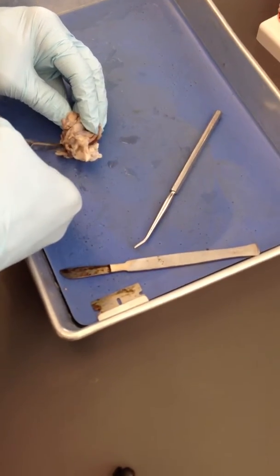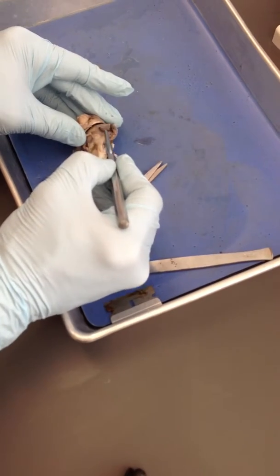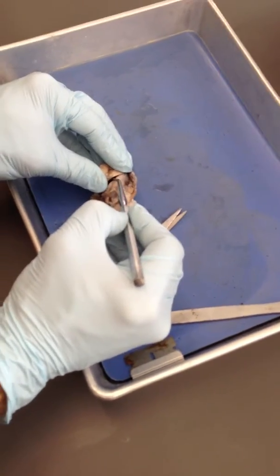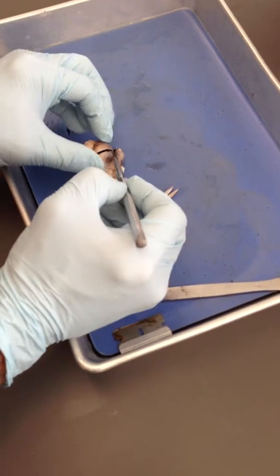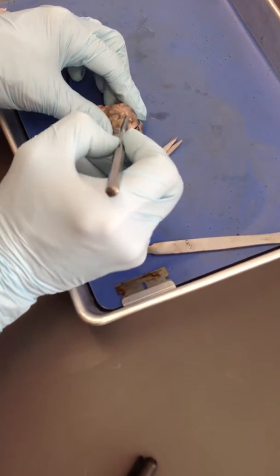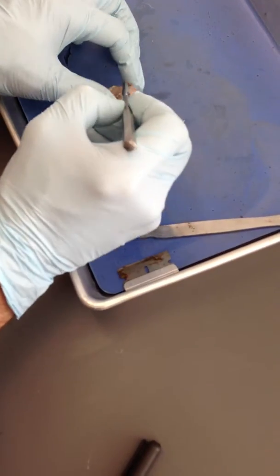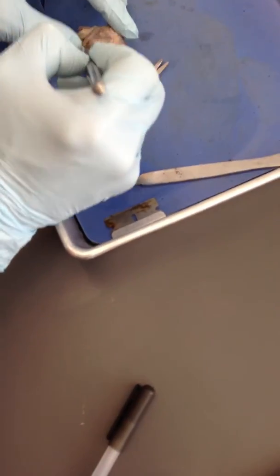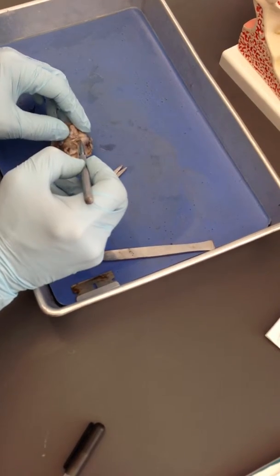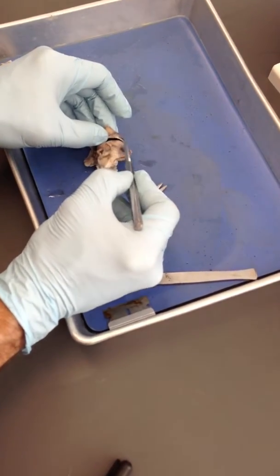Now, what you had to cut through was sclera, of course. We can review the layers here. This is sclera, very tough, and that was the hardest thing you had to cut through. That's the outermost layer of the eye. Situated around that is fat. So this is all fat, and also some of the muscles, like the superior rectus and inferior rectus and medial and lateral and so forth. So those muscles are also around there too. Okay, so let's work our way in. So sclera is the outermost right here.